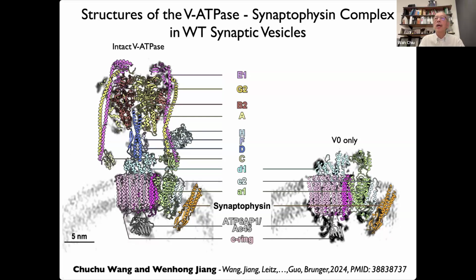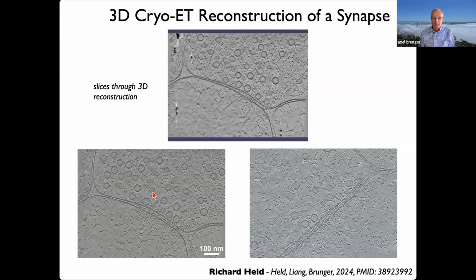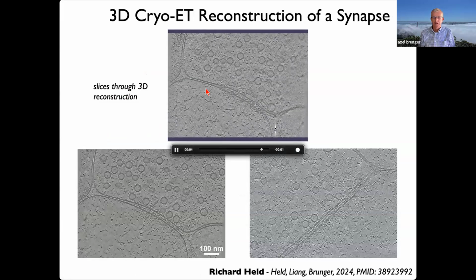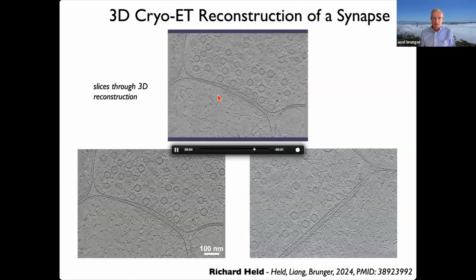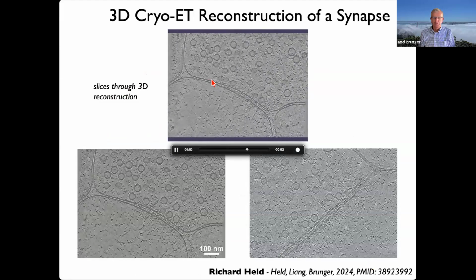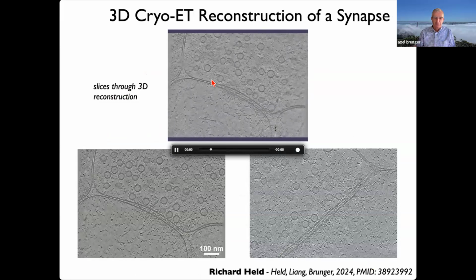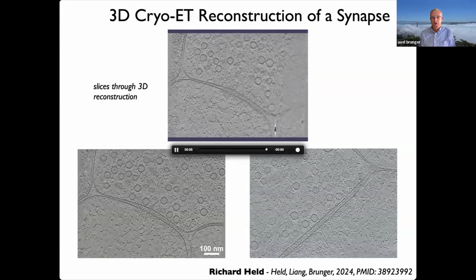Have you been able to capture the synaptic vesicle while they're fusing? Yeah, very good question. This is coming back to the images that Richard collected. Every once in a while, we do see something which is more like an omega shape, not in this image here, but there are other examples. And of course, we don't really know if that's in the process of fusing or in the process of endocytosis. So we do see other situations, but they're really rare at the moment.